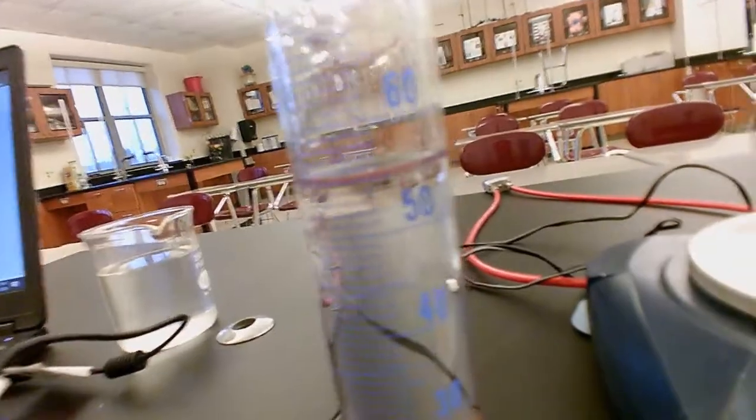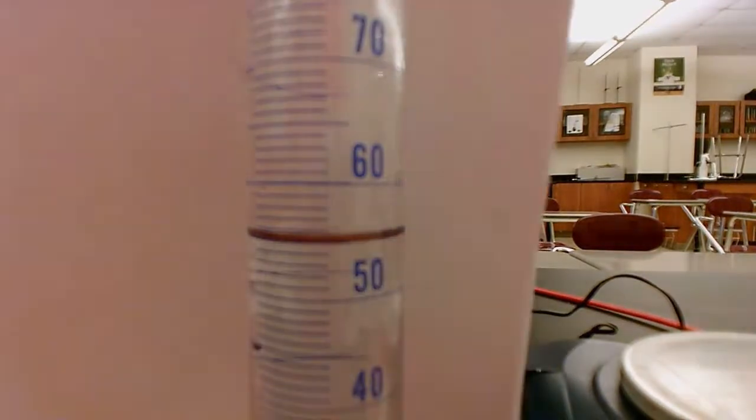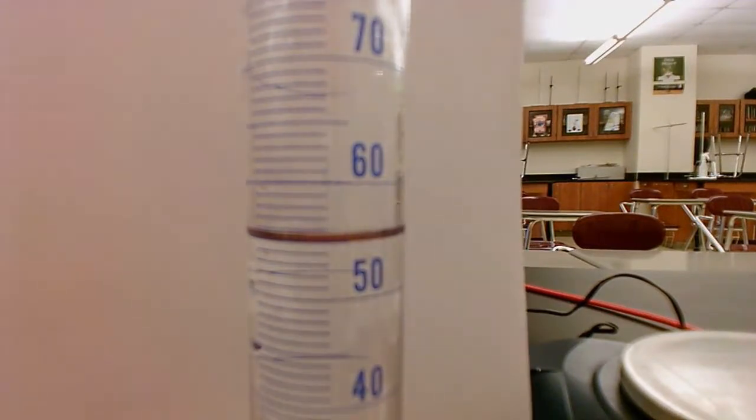This is not very user-friendly. There we go. Make sure you're recording these volumes to 1 decimal place.